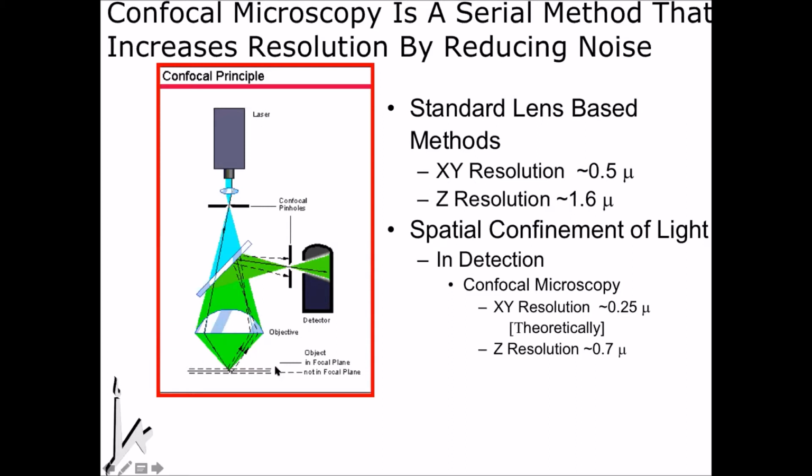When you scan the sample, you get the highest resolution because all aberrations of the lens that are called off-axis aberrations are removed, and only spherical aberration, which is an on-axis aberration, is included in the image. So the bottom line is you get the highest resolution by scanning the sample. Here, a nanomotion stage could be very good because it doesn't require a tenth of an angstrom resolution, things like that, but it does require a large area scanning.